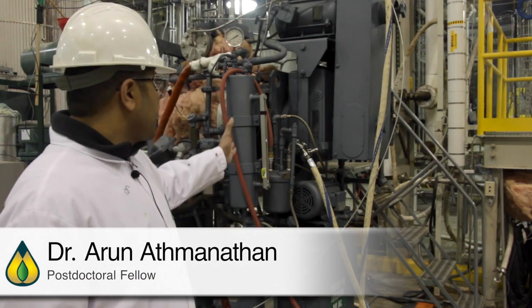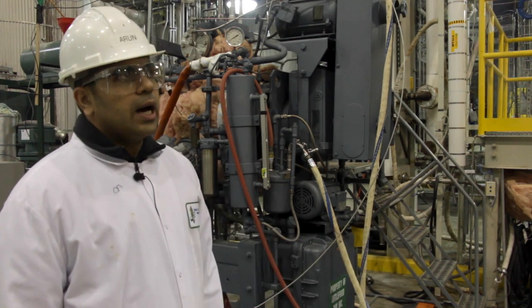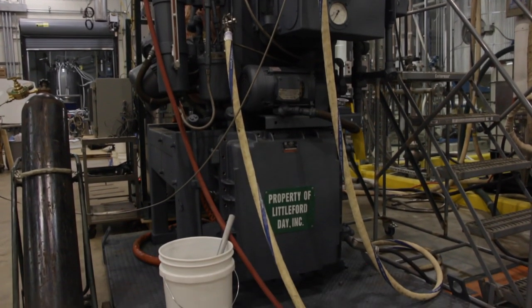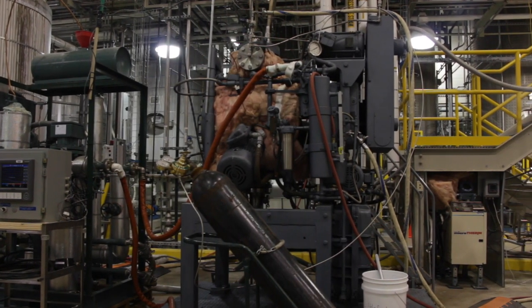The machine we have here is a Littleford Day 130-liter reactor. This is a general-purpose reactor, which in this particular case we are using for the process of biomass pretreatment.